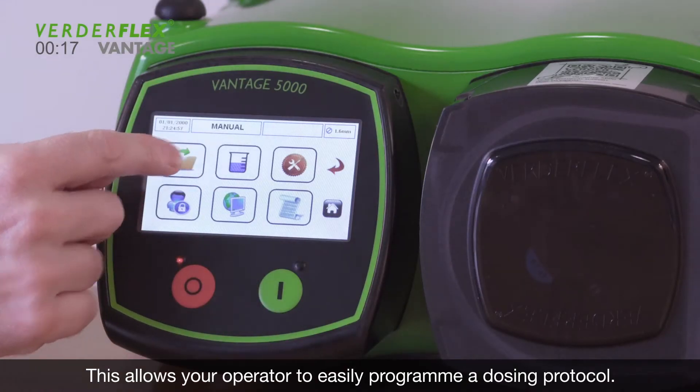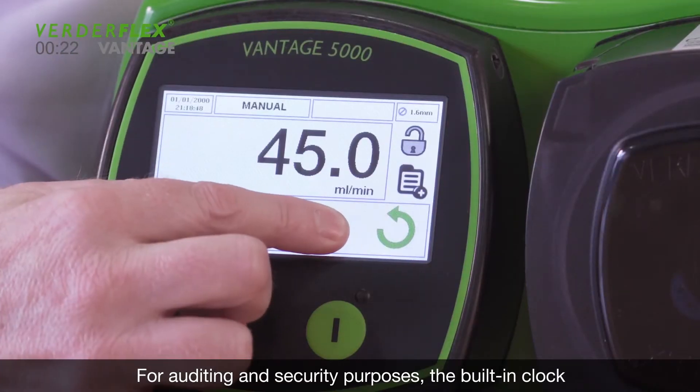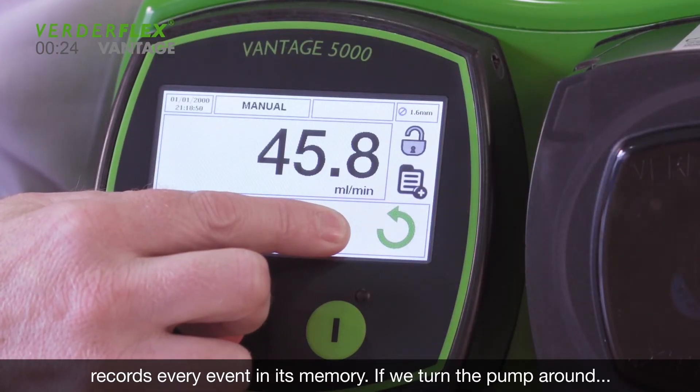This allows your operator to easily program a dosing protocol. For auditing and security purposes, the built-in clock records every event in its memory.